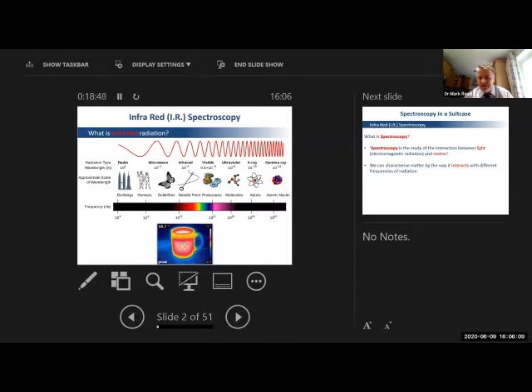We can't see either side of that region, but if we could see lower in energy, neighboring that region is the infrared region. Now, like visible, it is a region. There are several wavelengths within that region. Although we can't see them, they're very useful. Infrared is used for remote controls and also for thermal imaging, because hot bodies emit infrared radiation. And if you detect that and convert it to color, as the hot cup of coffee at the bottom shows, you can visualize this infrared radiation.